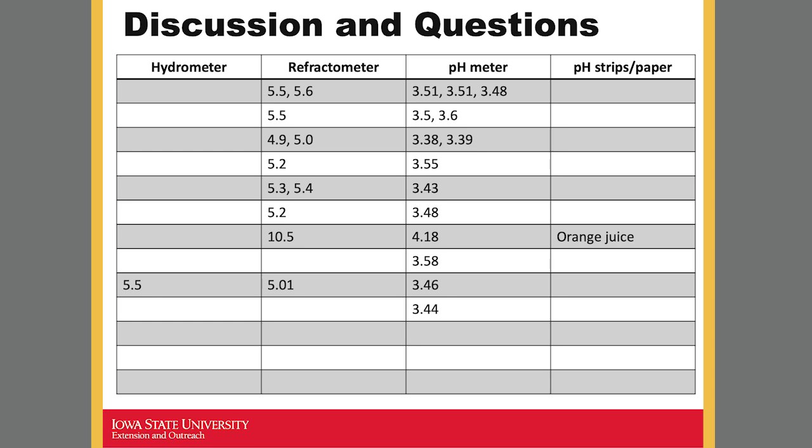I recorded 5.6 with both the manual and the digital. It's just a little bit harder to see exactly where that line crosses with the manual refractometer, but it does give you a good estimate. But it is still worth noting if your room, dining room, winery, whatever is at a temperature that's significantly different than 68 Fahrenheit, 20 Celsius, you'll want to consider making a slight adjustment.